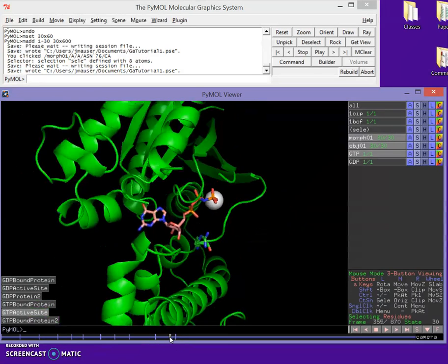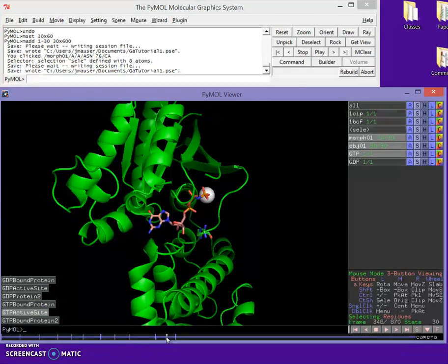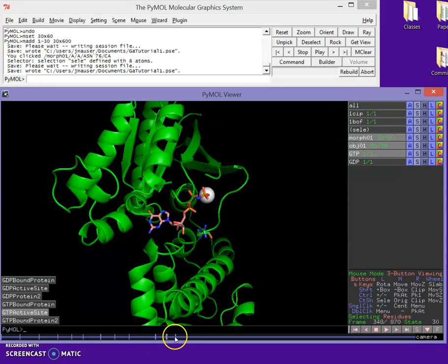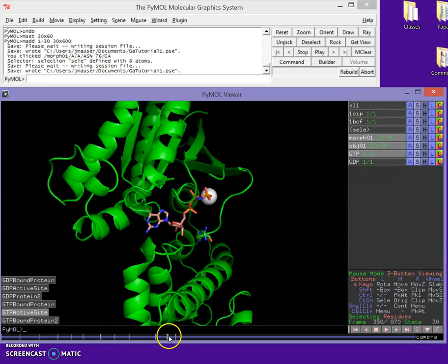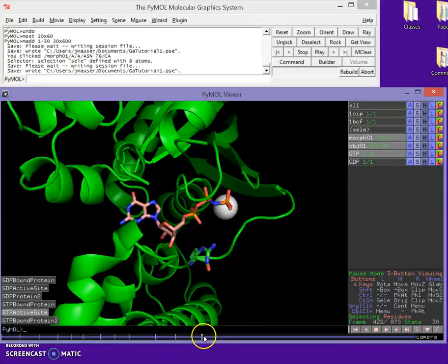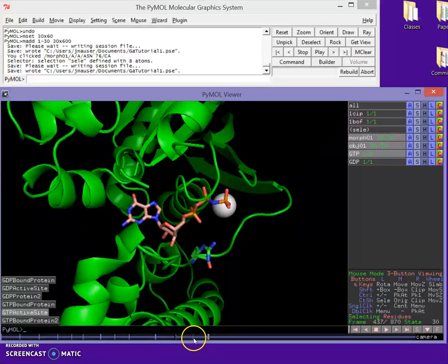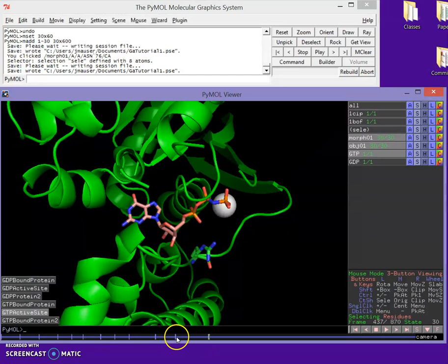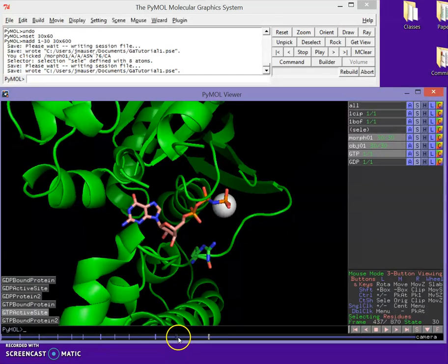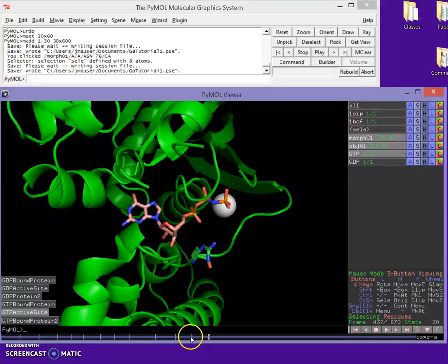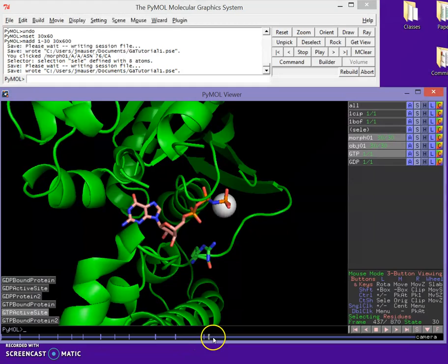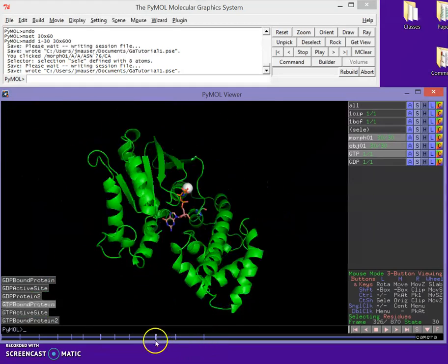So that's just one interesting thing. I'm going to hold that scene just a little longer because it's going to essentially play through and zoom back out. I don't want it to. I'd like to hold it. So again, we're going to hold down shift, right-click, and drag that out. Make sure you can get it right on. Seems a little tricky. There we go. And once you've got it, you can adjust it. It's pretty easy. I'm going to adjust that up here.